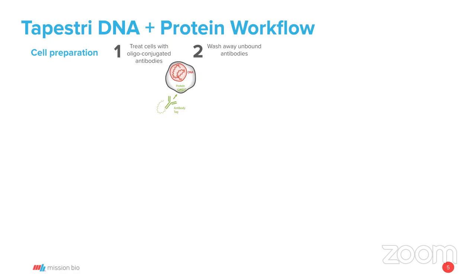Great, thank you. And the cell staining protocol, we do have a specific cell staining protocol that we're currently updating, but the premise of cell staining is very similar regardless of which platform, which technology you're using. Basically, you incubate the cells with some kind of cell blocker, and then you add your antibodies and you wash away the unbound. So those are the basic steps in the cell staining protocol, but we do have a guideline on that. And if you're running this protocol, you should use our guidelines on cell staining.